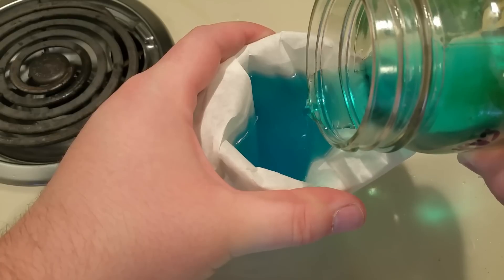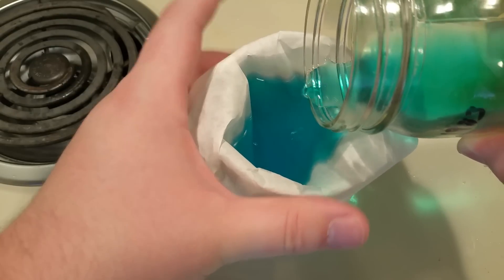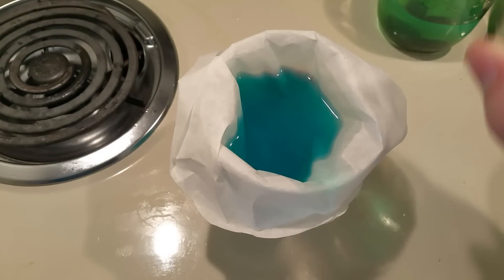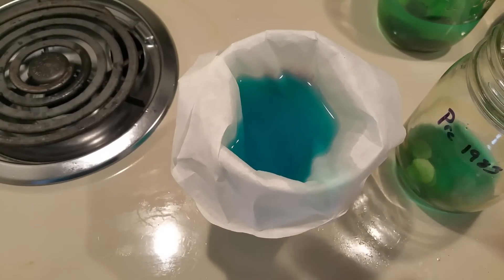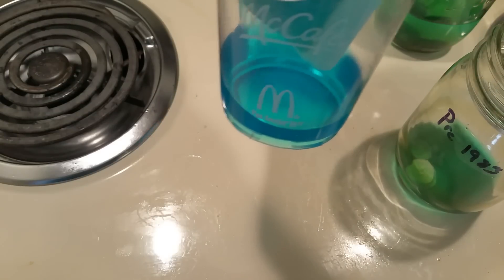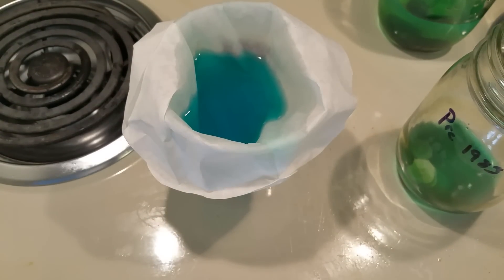Here I have some disposable cups and disposable filters. I cannot stress how important this is — copper acetate is highly toxic to small animals and children, so be sure that you understand these risks. I will speed up the filtration so you don't have to watch all of it, but the idea is you want to get rid of all the copper oxides and keep them on the filter paper.